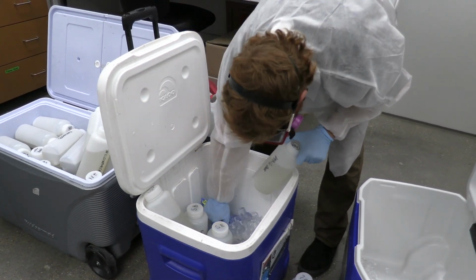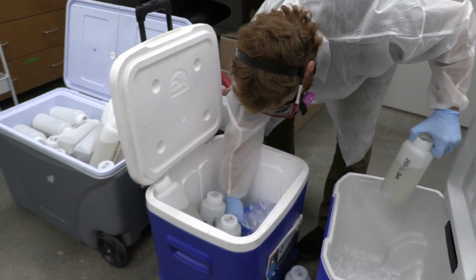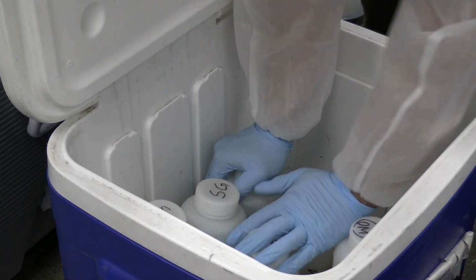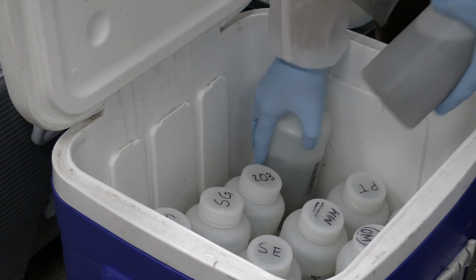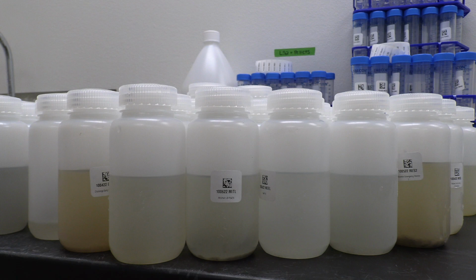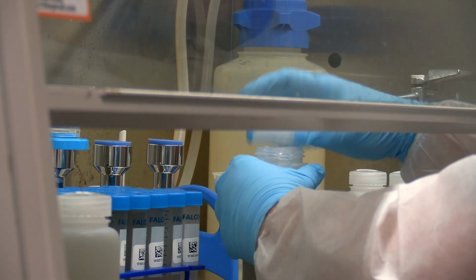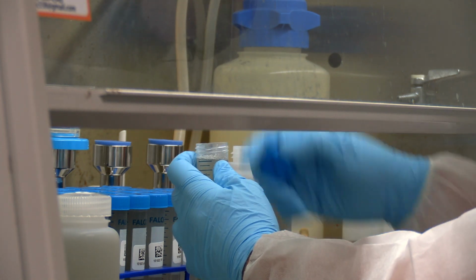Untreated wastewater samples are collected by Houston Public Works and Houston Health Department personnel from wastewater treatment facilities, lift stations, and manholes around Houston, Texas, and are transported on ice to Rice University and the Houston Health Department laboratories for analysis. Samples are generally received in barcoded labeled bottles containing information about the type of sample, facility, and date of collection. Mixing of samples is important to ensure samples are homogenized before being aliquoted into their respective centrifuge tubes in preparation for centrifugation.